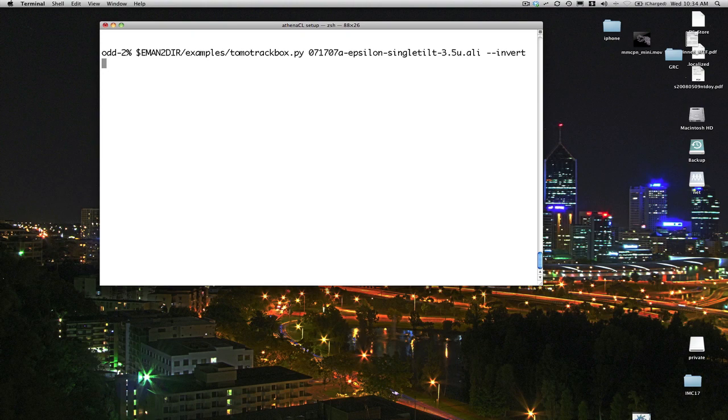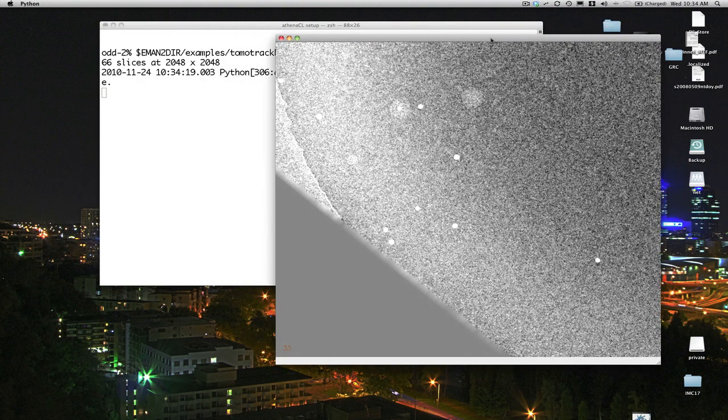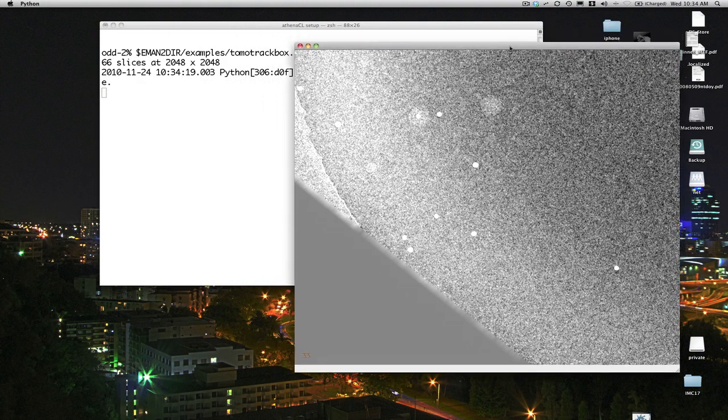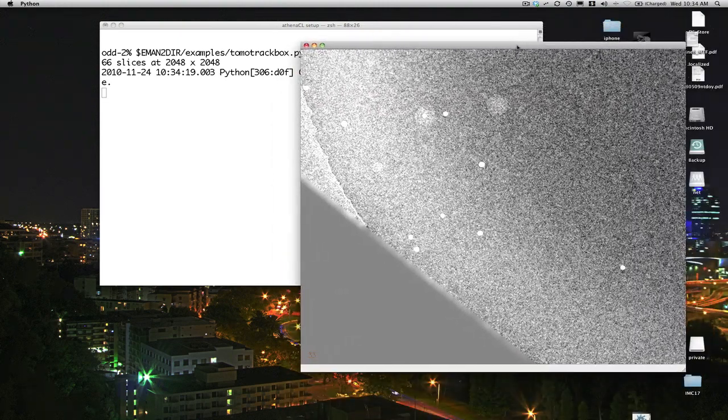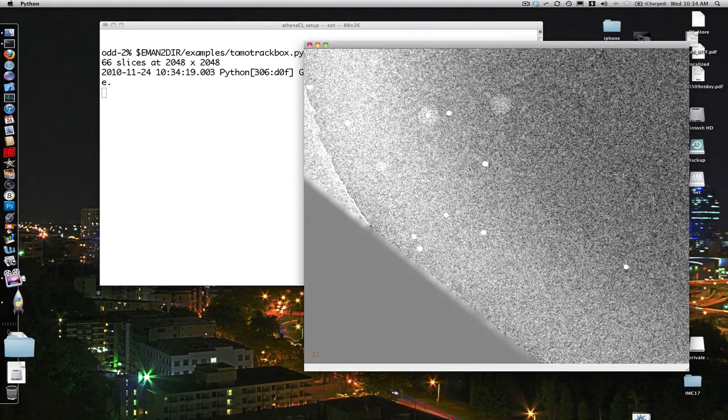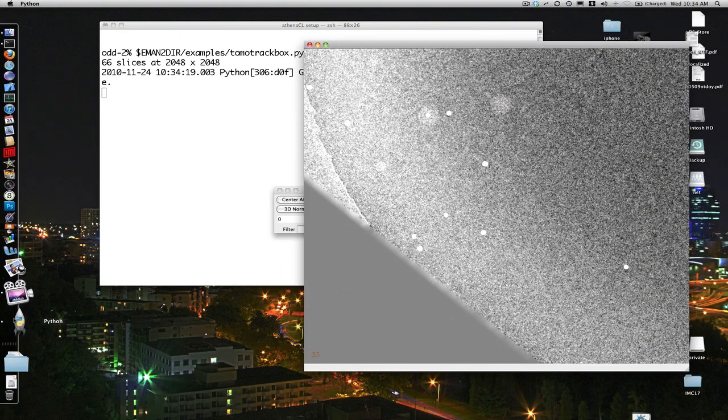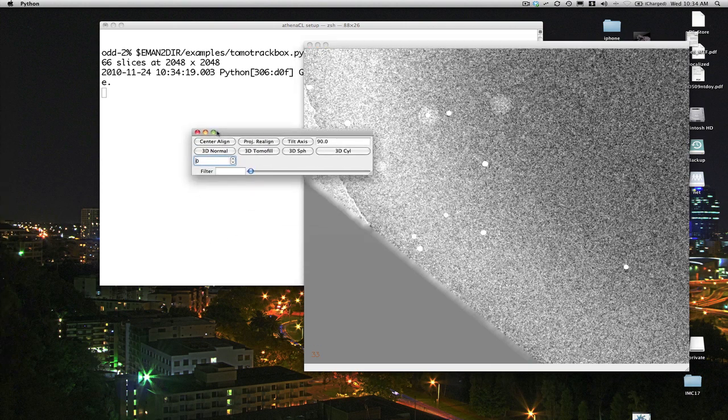Now after we run the program, we'll see two windows appear. We'll see one window containing image data, and another window, let's bring it to the front here, containing a control panel.